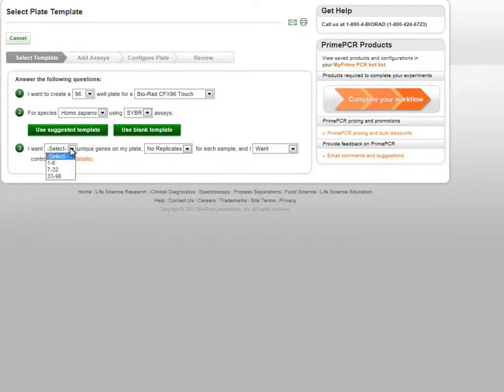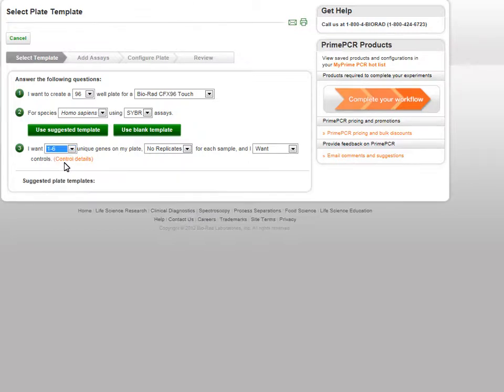First, select the number of genes from the drop-down menu. A range is present, so select the range which your unique number of assays fall in. In this example, we used six unique gene assays, so we will select the 1-6 range.